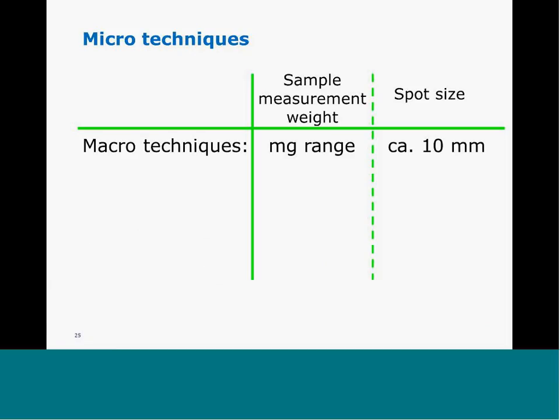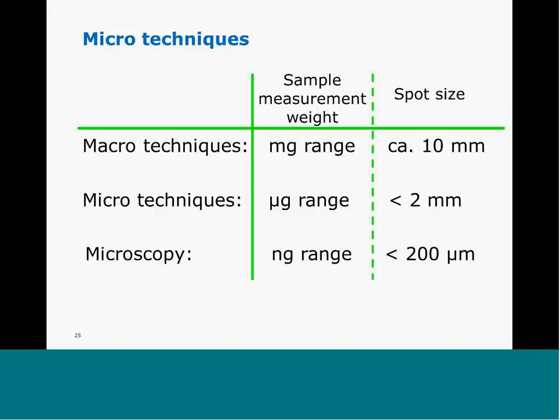So, the things I have to discuss. Before, we were talking about regular infrared spectroscopy. Now, if you have small samples, can you measure smaller samples? You can. What you need is a microscope, which allows you to measure samples as small as a few microns.